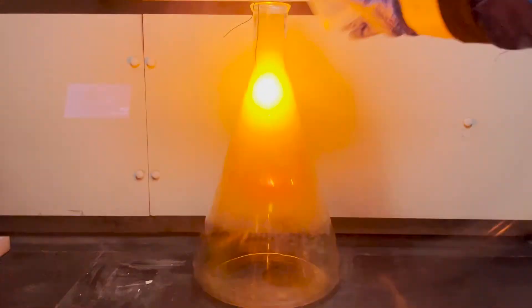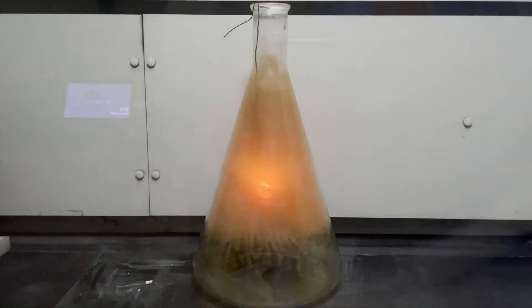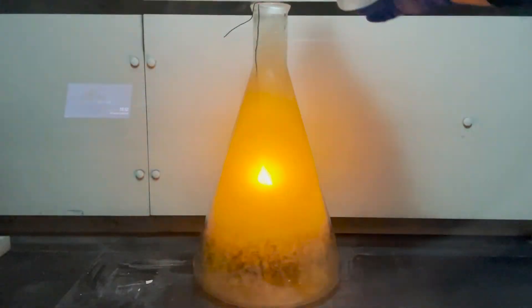To speed up the reaction even more, I use a wash bottle to add just a bit of water. This reacts with the sodium and creates a fresh surface to continue the reaction. It also provides some serious fireworks.